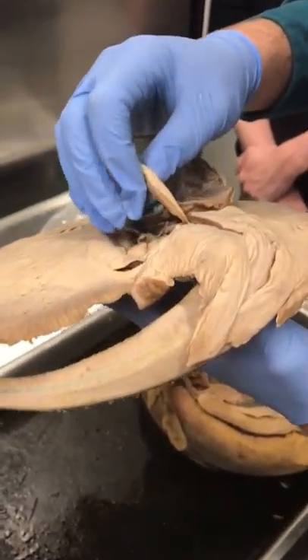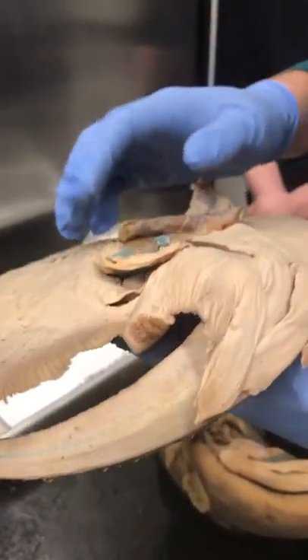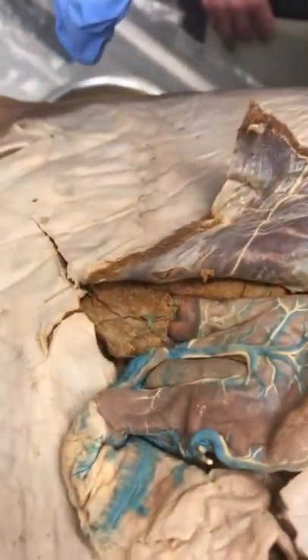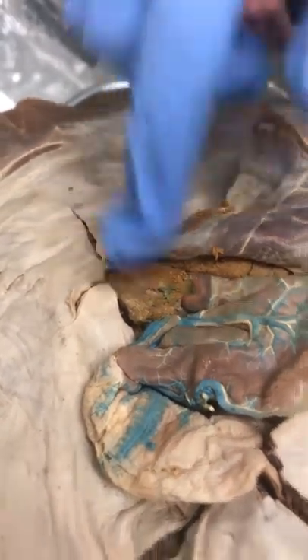The stingray's liver is going to be this leaf-shaped structure right here. The liver has basically the same texture and look for the most part — the brown thing on top, right here.